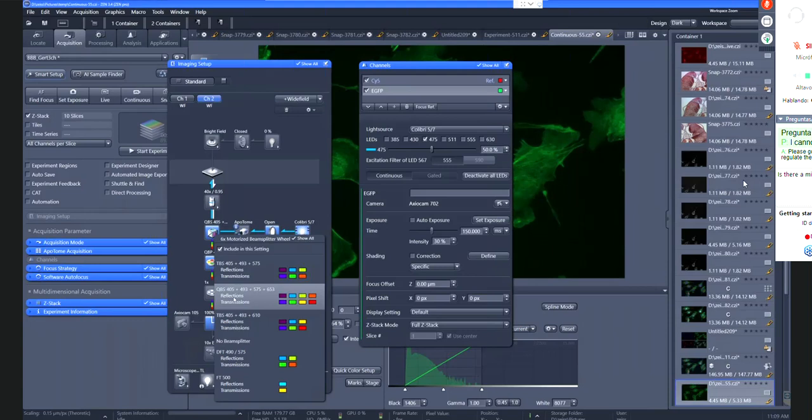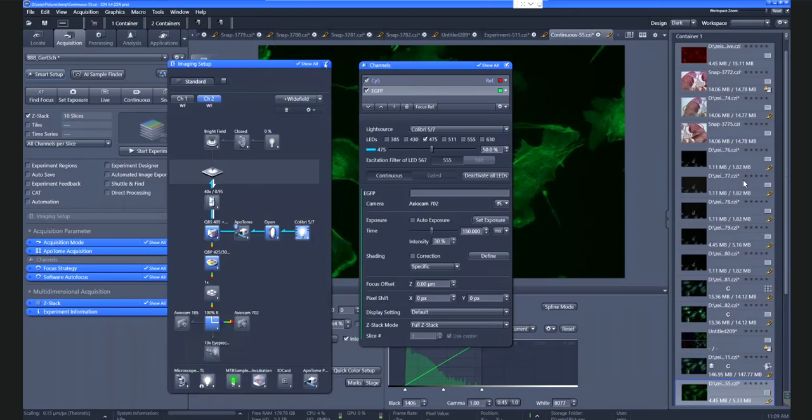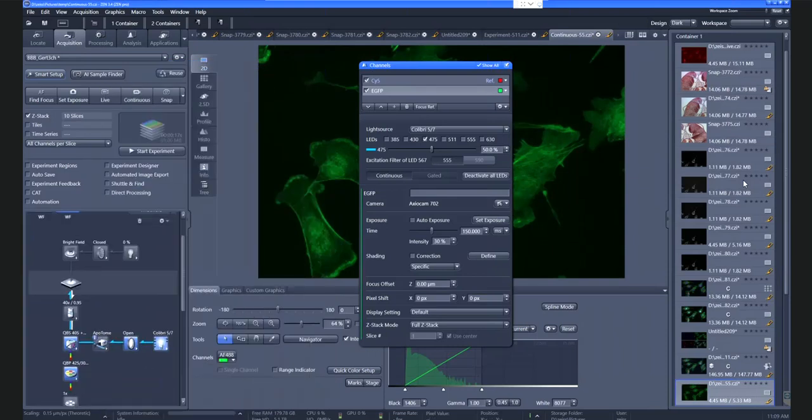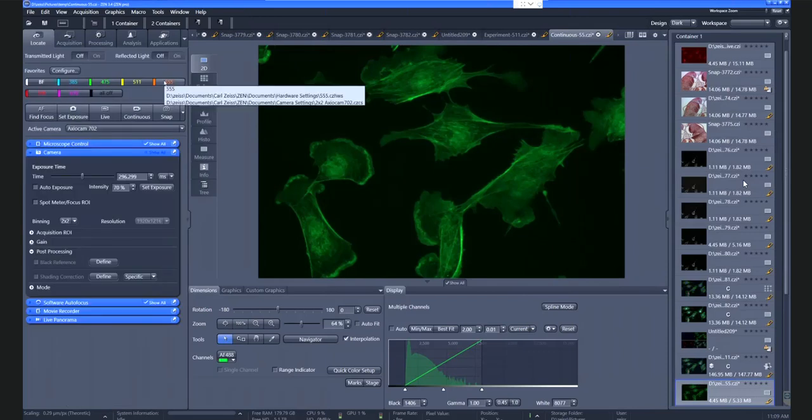It might help if you talk about a brain section, which is quite huge, and you have to scan this fully over 3D using tiling. Then the file at the end will be quite huge if you stick to your 12 megapixel camera all the time through. So binning can be of help even with a fixed sample. If we talk about binning again, let's close this here and check this out once again.